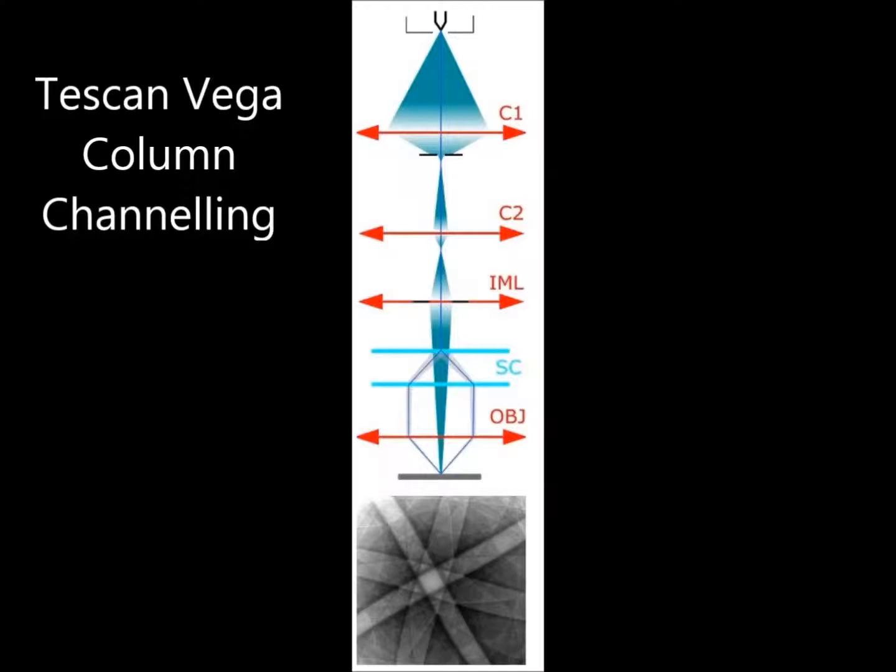The excitation ratio of the scanning coils is set up so that the beam utilizes the whole area of the objective lens bore and enters the lens parallel to the optical axis. All electron beams parallel to the optical axis are focused by the lens into a single point on the specimen surface. As a consequence, the scanning is transformed into a beam tilting. As an example, the resulting pivot point of the scanning lies on the specimen surface plane.